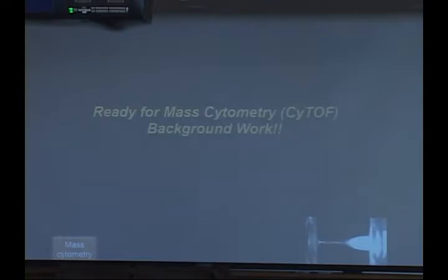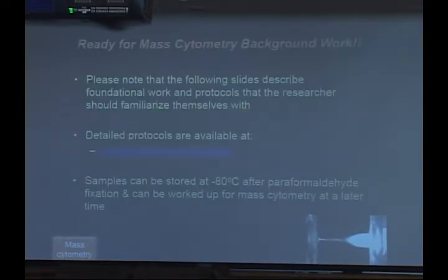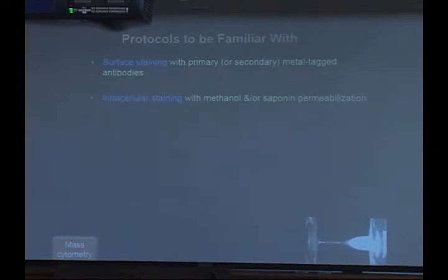And so now you should be ready for mass cytometry. There are lots and lots of detailed protocols available, and you're going to have access to them, so I'm not going to go into it too much. Again, I just want to emphasize that a great stopping place, if you want to send samples to somebody, is freezing after fixation. So the protocols, again, this is the list slide, and I'll pop through it so that you know what to expect, because all my colleagues who will be speaking after me are going to go through these in pretty great detail.